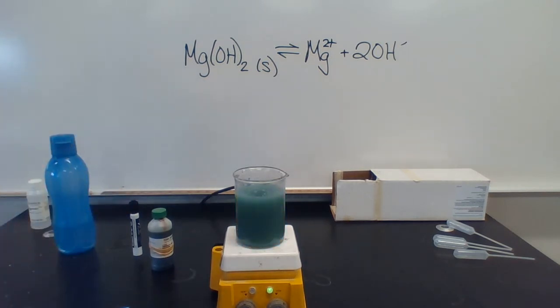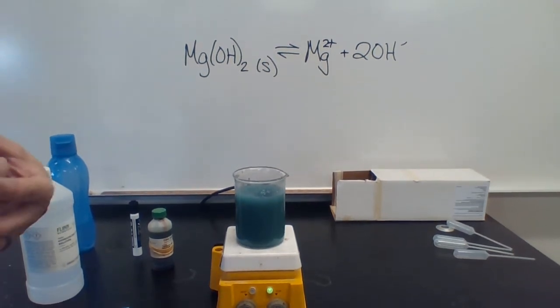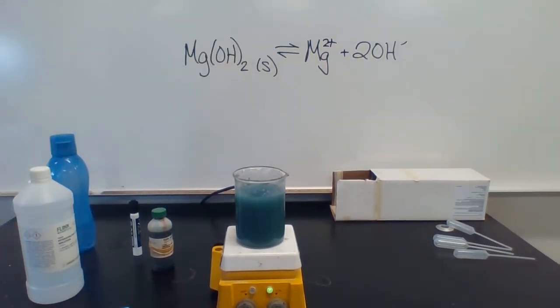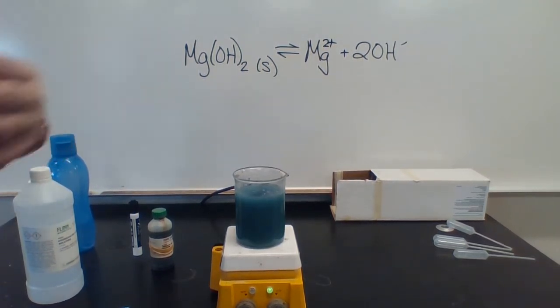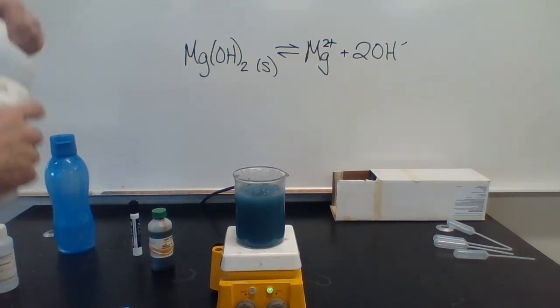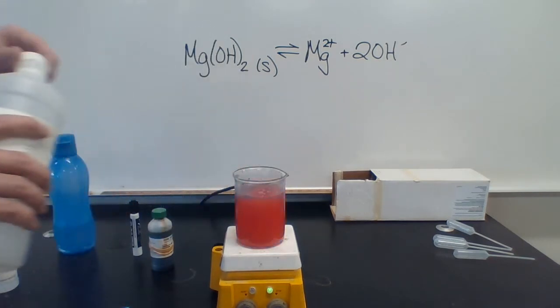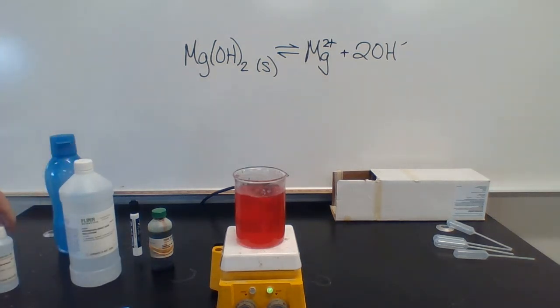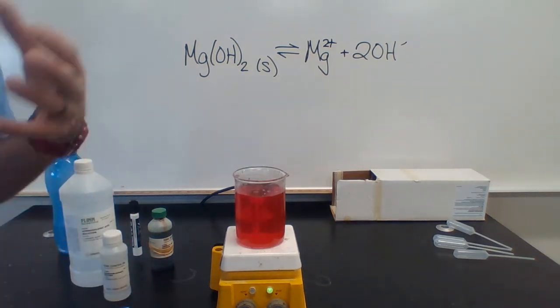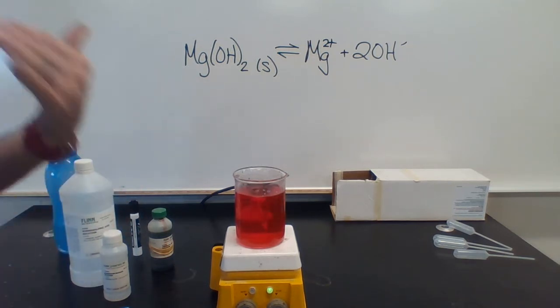And even longer here. Each time we remove some product, but we're still in an equilibrium system, the forward and reverse continue, and those forward and reverse continue until we get back to that same ratio we had previously. This one's a little bit harder to get just right when I'm just pouring random amounts. I want to see if I can get it to end in that yellowish. Oh, I already overshot it here. So I kind of passed my initial goal, but we're going down to the final thing.